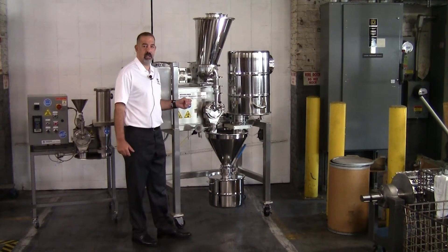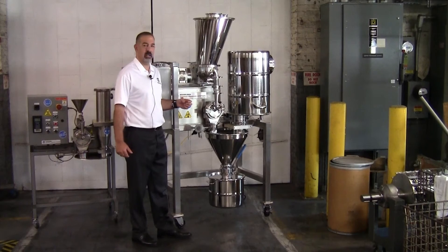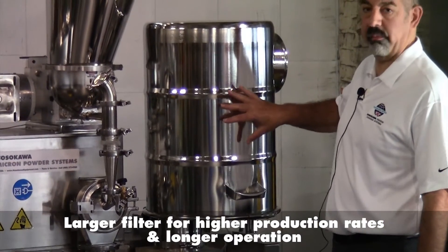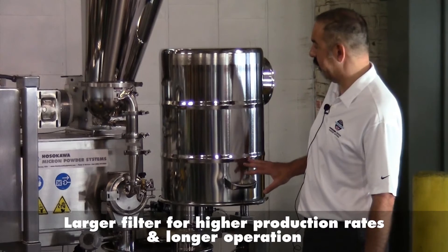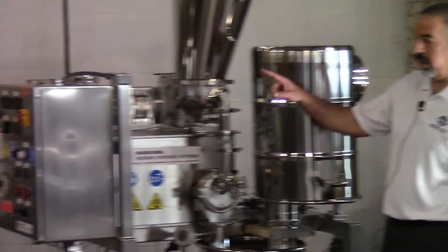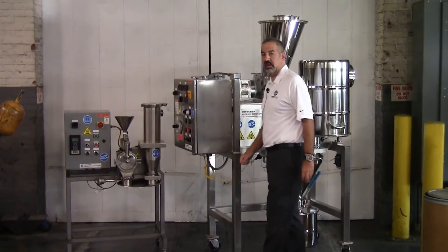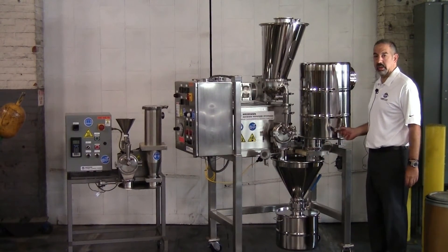With this customer requesting extended unit runs, we added a fairly large size relief filter housing. Comparing this housing — which houses a fabric filter element — to the one on the standard unit on the side, you can see the difference in size, which is going to give you a lot more capability of running the unit a lot longer.